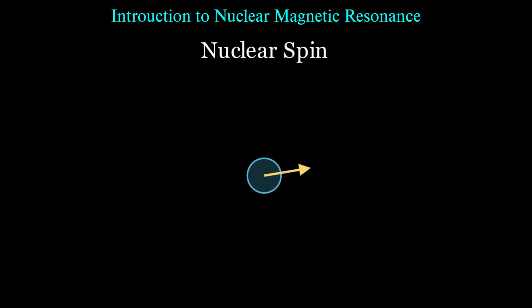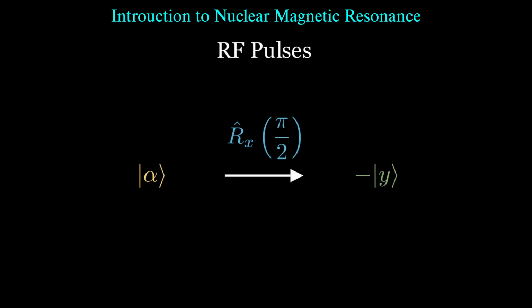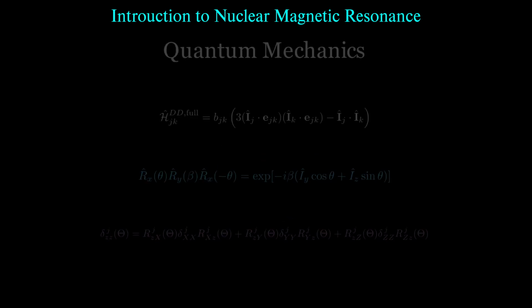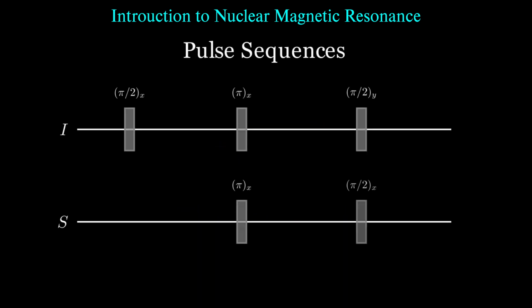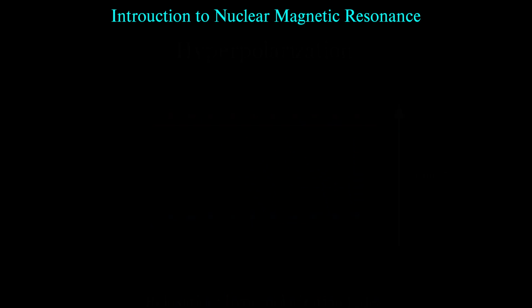First, I'll give you a very oversimplified explanation of NMR, the kind of explanation you'll usually hear in an introductory setting. Then, over what will probably become a 40 video series, we'll slowly dismantle that explanation and rebuild it from its first principles. And by the end, hopefully you can come back to this video and see why the simplified story, although useful, doesn't do NMR justice at all. So let's start with that version.